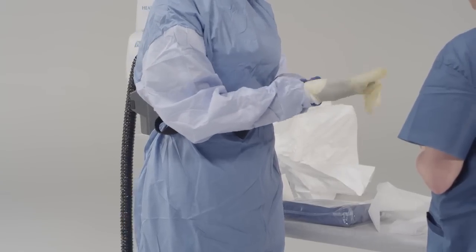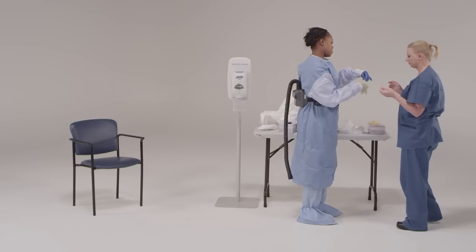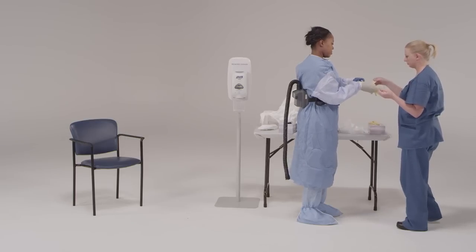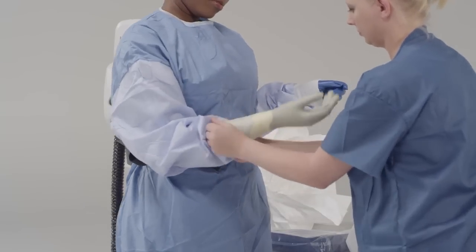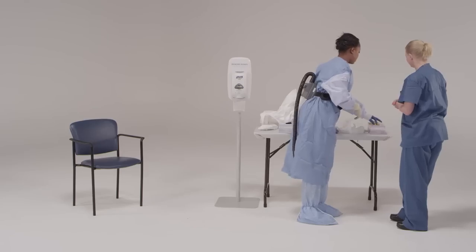It may be necessary to ask the trained observer for assistance when putting on the outer gloves. Double gloving provides an extra layer of safety during direct patient care and during the personal protective equipment removal process.